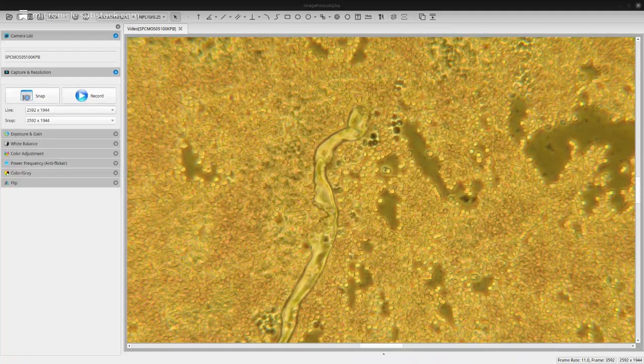I've seen other anomalies which I didn't know what they were. Some may have been the beginning of them. I'd have to go back and have a look. But last night I just added some distilled water to the edges of the cover slip to rehydrate. I don't want to let this slide dry out, because I'm just seeing what happens when you keep it hydrated as the cells degrade.